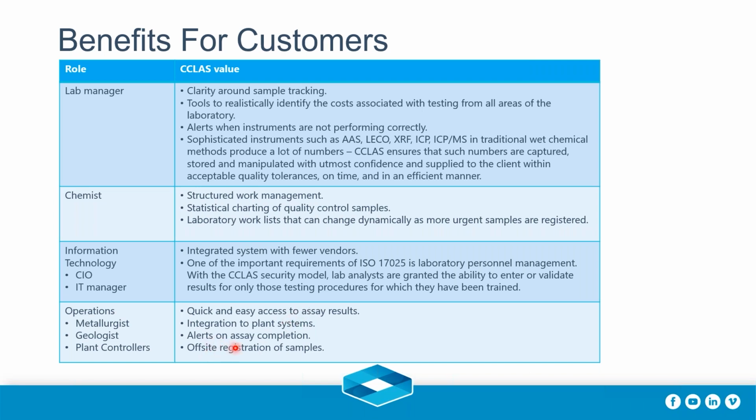There can be alerts on when assays are actually complete through email notification. And we can also do off-site registration for samples. So instead of giving users outside of the laboratory access to CCLAS to register their samples, we can register samples outside using an electronic request spreadsheet, which I'll talk about a little bit later on.